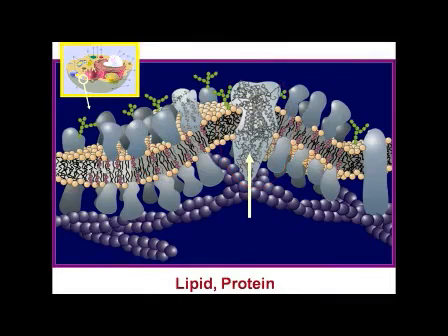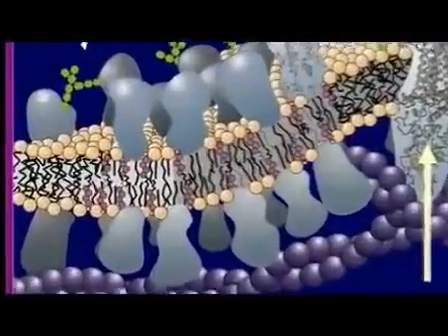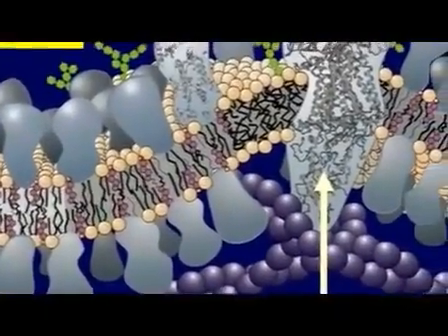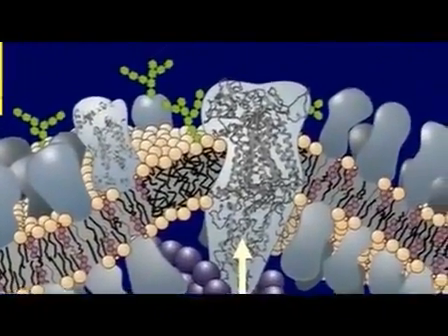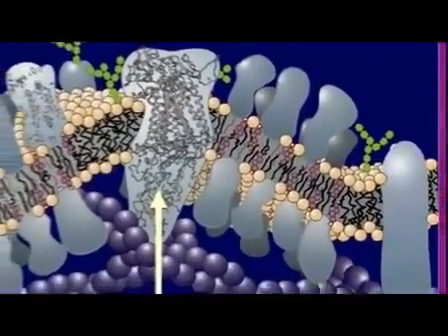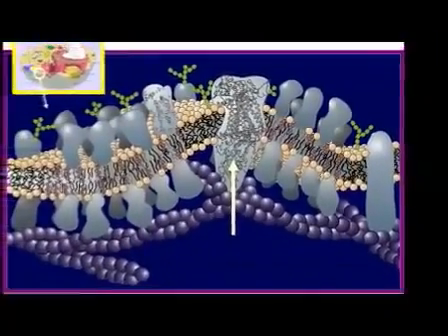However, for purposes of this JoVE series, I will limit my focus to membrane proteins. We seek to understand how these membrane proteins function at a molecular level for 2 reasons. Firstly, there is the intellectual satisfaction in knowing how something works. Secondly, by knowing how it works, just like your bicycle or car, there is the prospect of fixing it if it malfunctions. Drug design is an obvious outcome of this type of work.